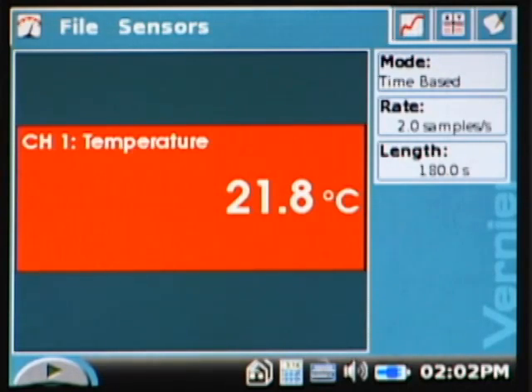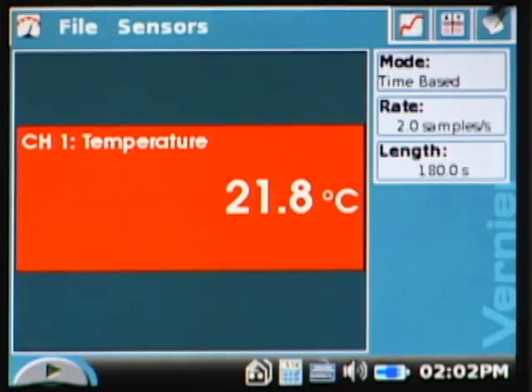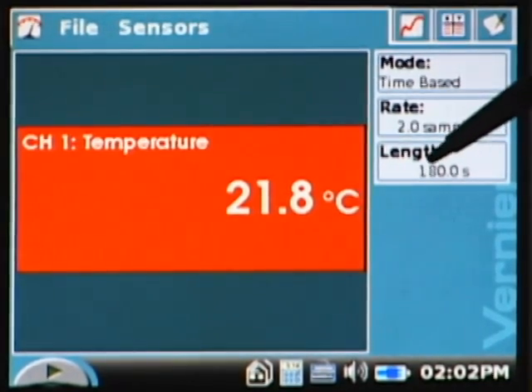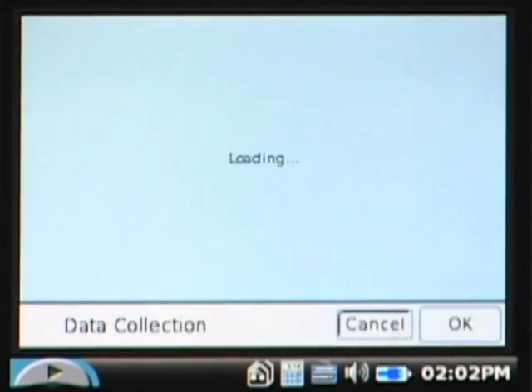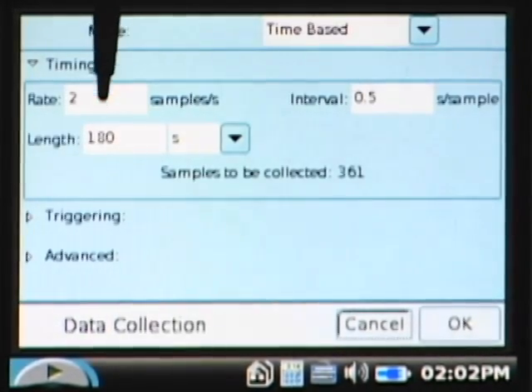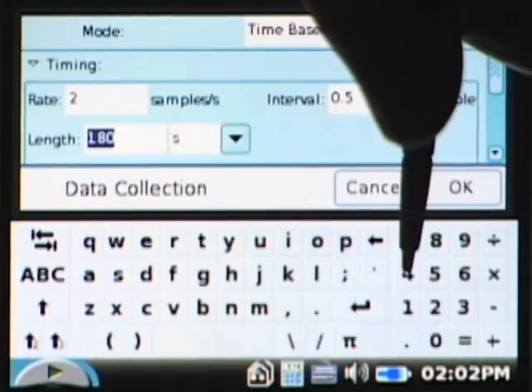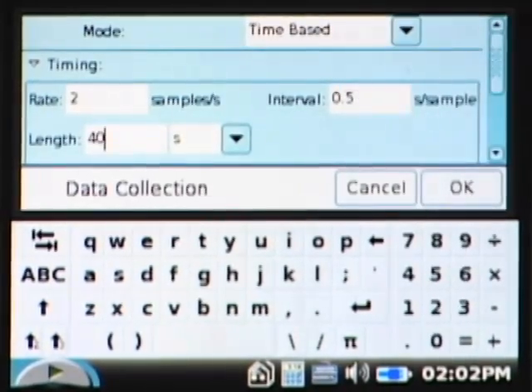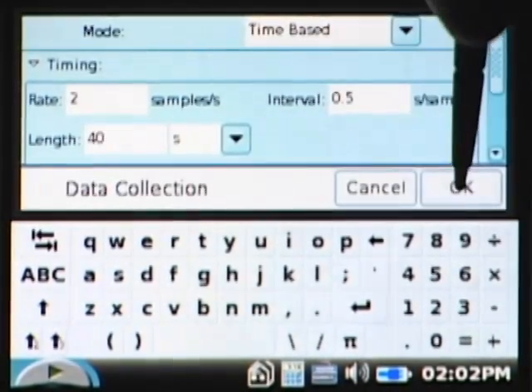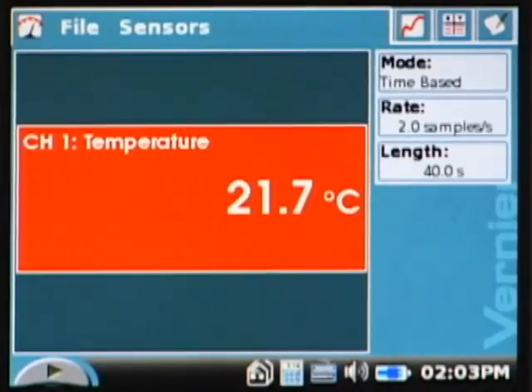In the lab, it doesn't want us to use that long of time, so we need to change that to 40 seconds. It's very easy to do - I just come down and tap on length, and I can go here and change my experiment length. Instead of 180, I want 40 seconds. I say okay, and now my experimental length is 40 seconds.